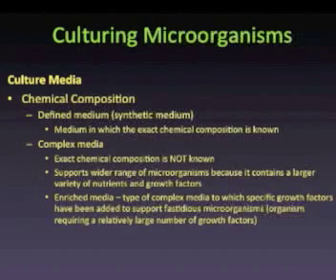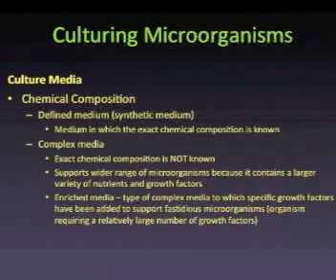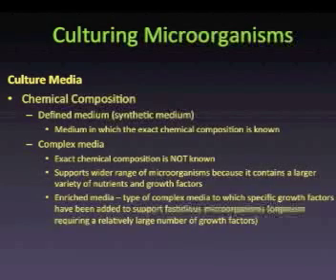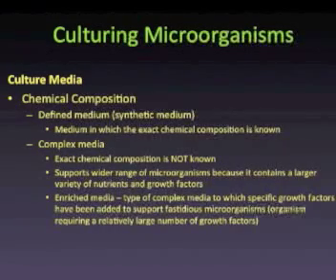Complex media may also have additional ingredients added that provide important growth factors for fastidious microorganisms. Please recall from our discussion of chemical and energy requirements that growth factors are organic molecules that the organism cannot synthesize on its own, and thereby they must be acquired in their diet.